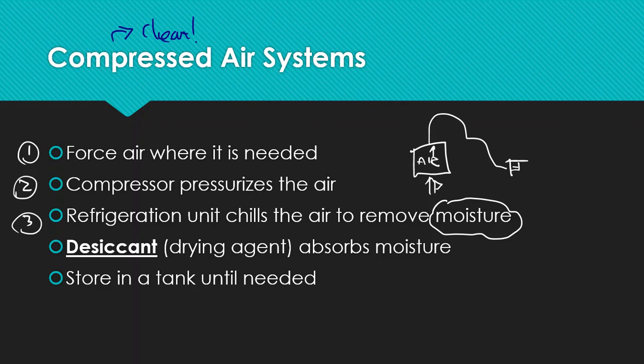So you're going to walk into a freezer and you're going to breathe out. That is air that you're breathing out. That is carbon dioxide that you are breathing out. But there's other things mixed with that carbon dioxide. It's not just carbon dioxide only, right? So you get this nice little foggy air that comes from your mouth, and you can actually see that gas.